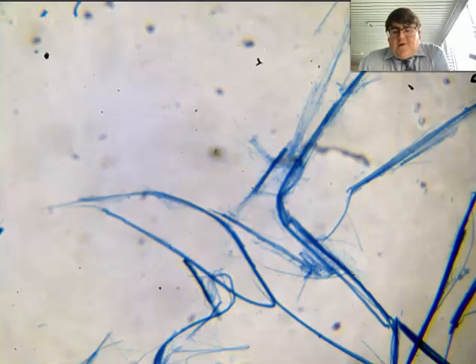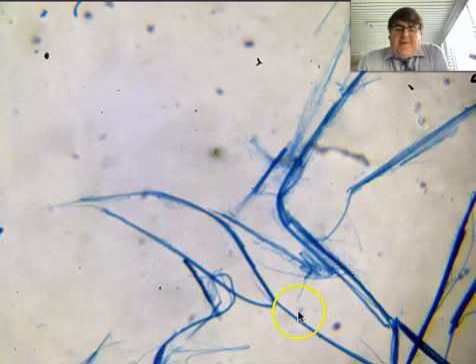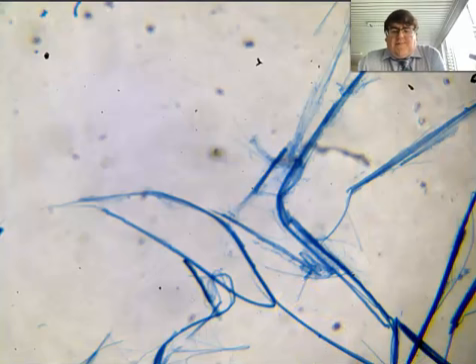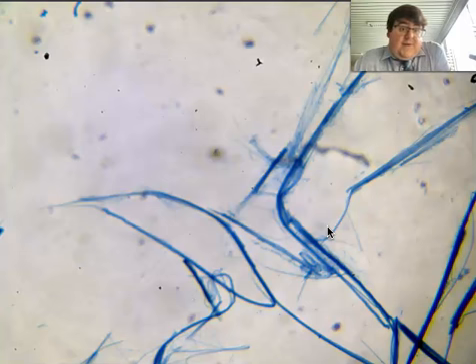I've got my scale where I know that the whole length of this is 2,200 micrometers. Maybe if I draw 1 centimeter along of that, divided by how many centimeters would be in the total length of my drawing, and the scale will be that equivalent down here. Then you label what you see. So maybe tangled muscle fibres, dyed blue, things like that, or some dots over here, or you try and be scientific if you know what you're looking at. But that would be how you label a video image such as this.